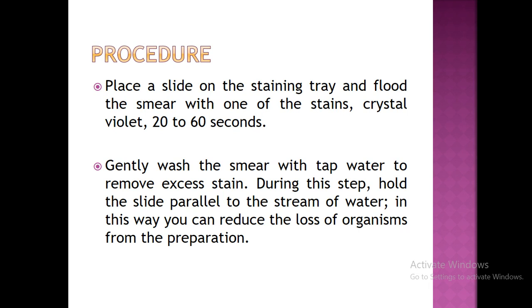This step is important, rather critical, because during this step you should hold the slide parallel to the stream of water. Otherwise, the smear will be washed away completely. You should gently wash the slide under the tap water by keeping the direction parallel to the stream of water.